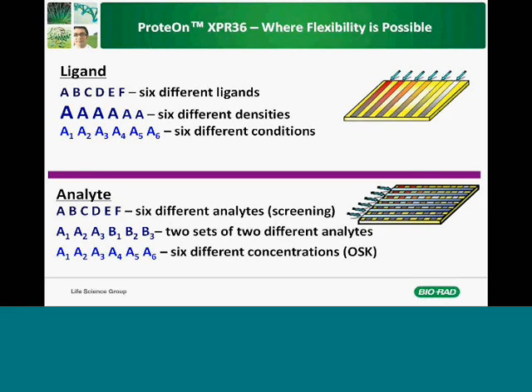You have the flexibility, and you can always go back from the ligand to the analyte step. This is very useful for more advanced applications, which perhaps we will demonstrate in future webinars.